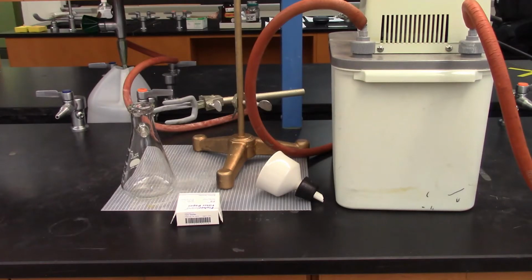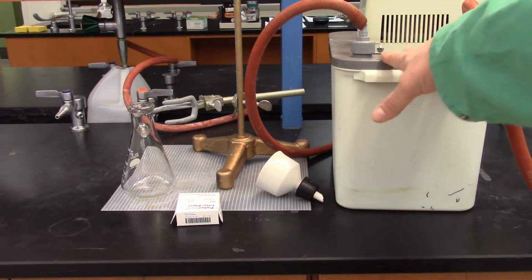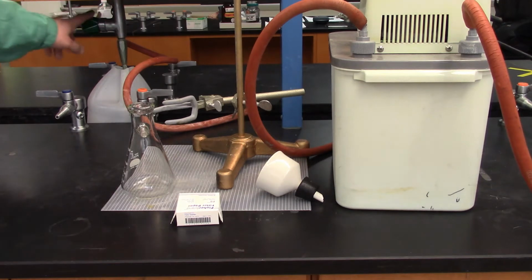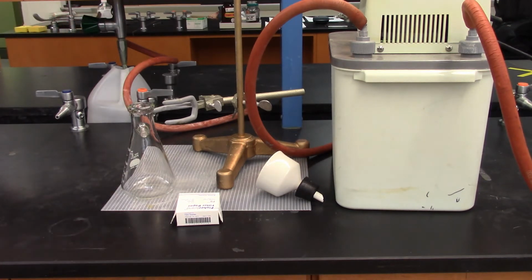All right, so here we're going to be doing a technique of preparing a vacuum filtration, and we're going to do two methods here, one using our aspirator which we plug in, and then another aspirator here which is attached to the sink, and we use just the flow of water to create suction, okay? So depending on what lab station you're at, we're going to be using whatever piece of equipment is most convenient to accommodate social distancing.